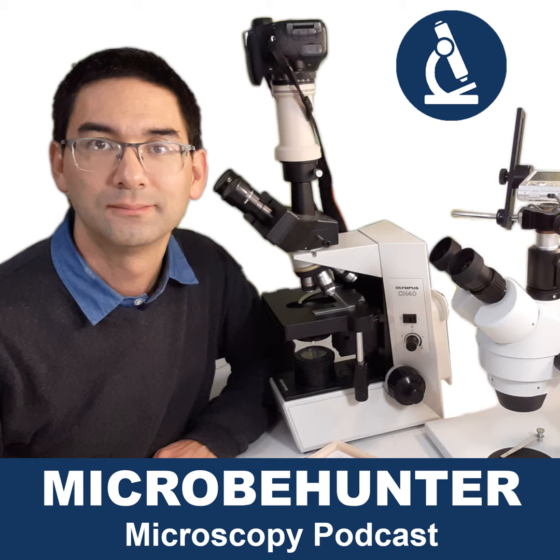The reason they ask this question is because they want to figure out: are you more interested in observing things for which you need a compound microscope, or are the things more suitable for so-called stereo or dissecting microscopes? These are the two microscope types used a lot in amateur microscopy. Their operating principle is very similar, because both have objectives and eyepieces.